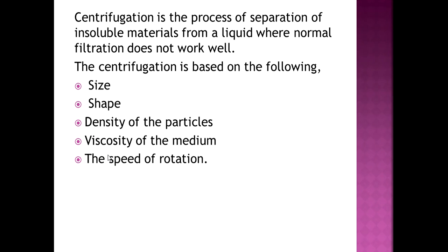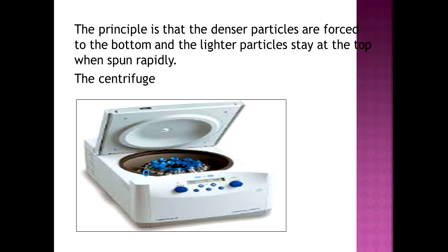So basically that's it, ladies and gentlemen. Let's go to the other factors. The basic principle, the mother principle, is that the process of centrifugation is based on the density of the particles.